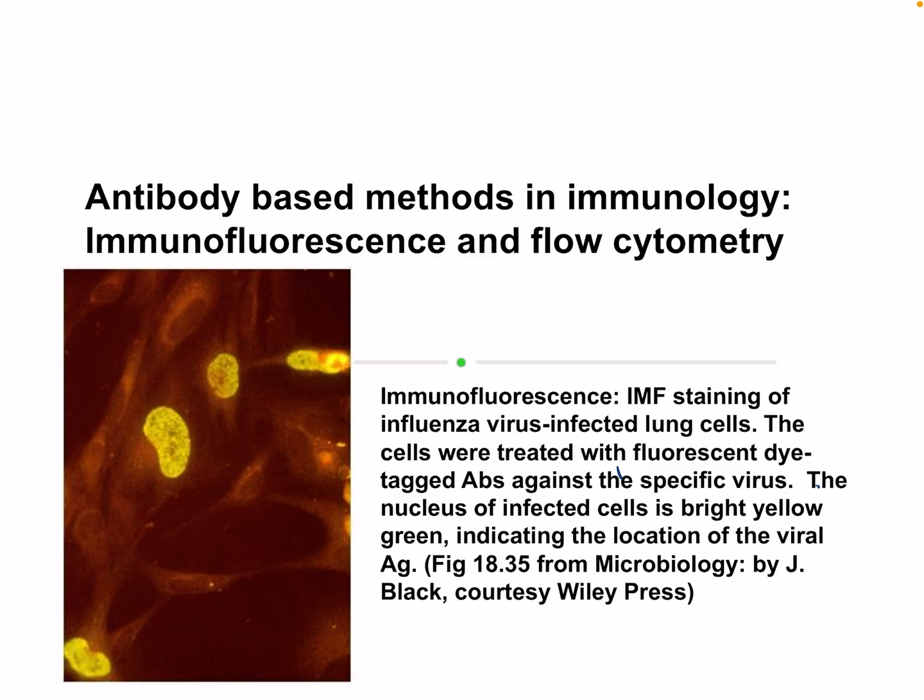Hello everyone, welcome to our final Immunolab lecture, and also our final lecture in the immunology series. I hope you have enjoyed it so far, but today we're going to be looking at antibody-based methods of immunology, and we'll be focusing on immunofluorescence and flow cytometry.